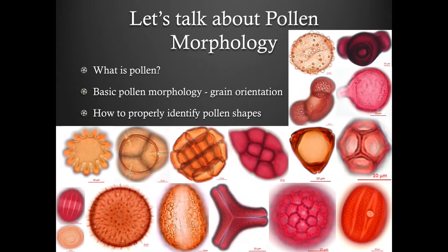As you can see in these images, pollen grains can vary greatly in their appearance and morphological characteristics.